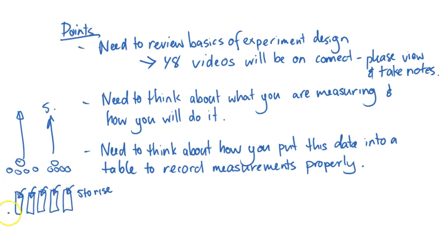Okay, you can't measure these whole things as a group. You're trying to compare the differences. So you had to find the amount of time it takes for 5 to rise in each tube. And if you have more leaf discs in those tubes, say up to 10, even better, because that means that if you've damaged any, then you still only have to wait for the first 5 to rise, and there's less chance that error is going to hold you back.